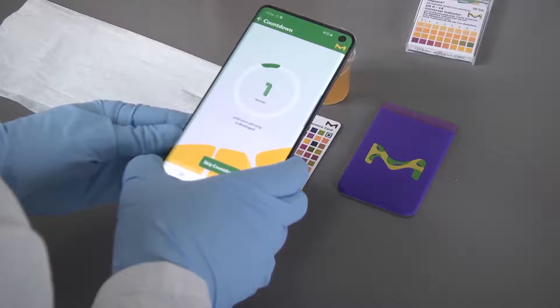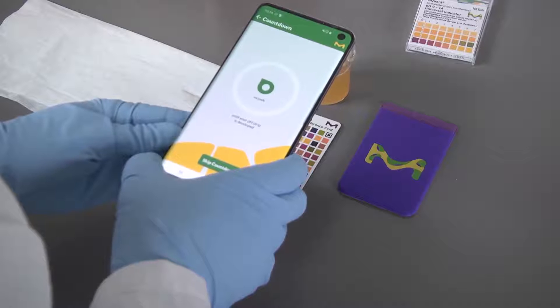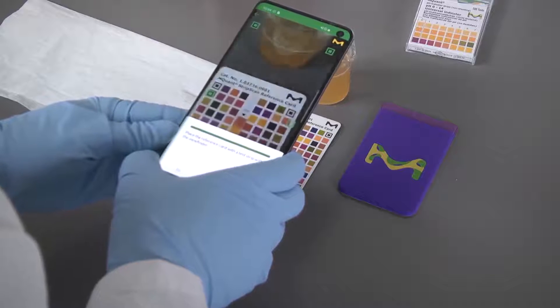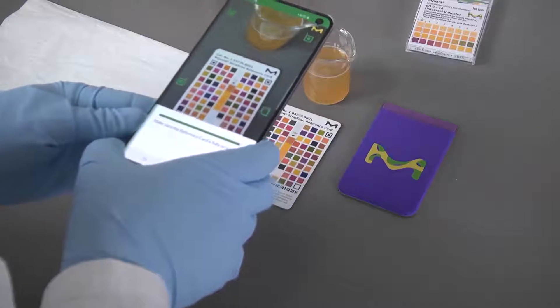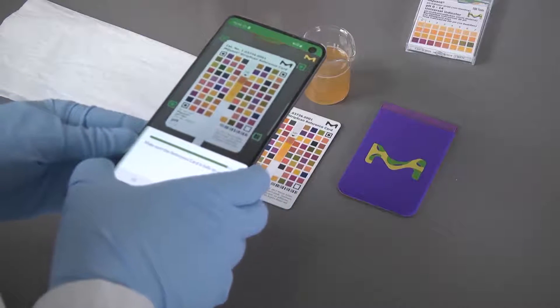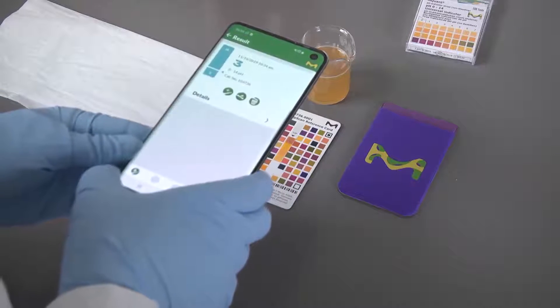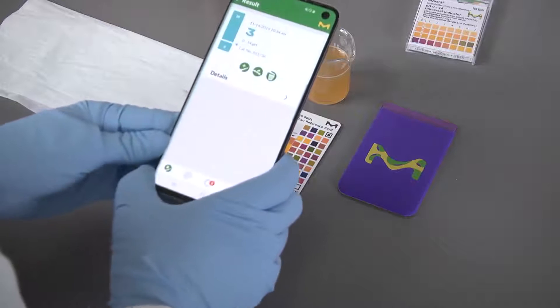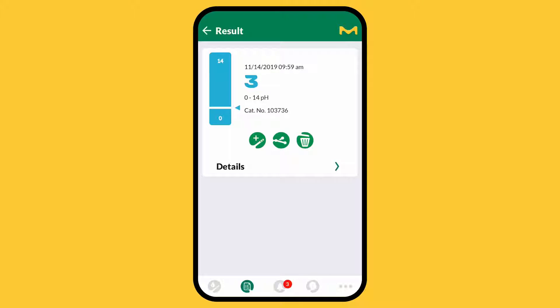Once the countdown is up, the camera opens automatically. Place the reference card within the viewfinder. The algorithm triggers and automatically displays the result.